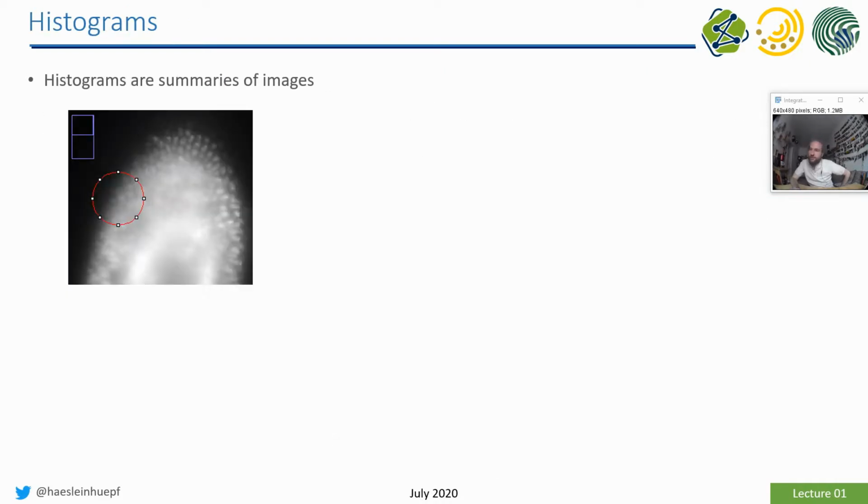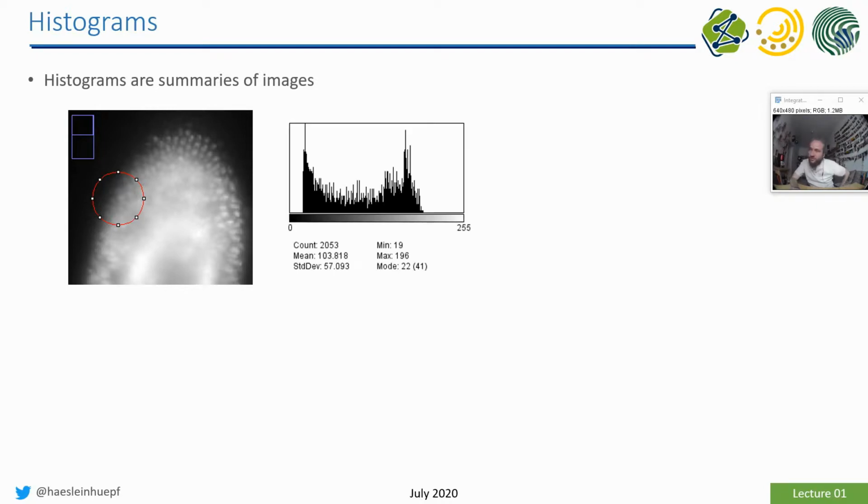Furthermore, for inspecting image data, you can look at image data and change lookup tables, but you may also want to do a summary of your dataset. So you see here, for example, a histogram. What is a histogram in the context of pixels? You see here that we basically only have grayish pixel values in this image, and maybe some black, and maybe a peak in a brighter gray, and that's what we can also see in the image.